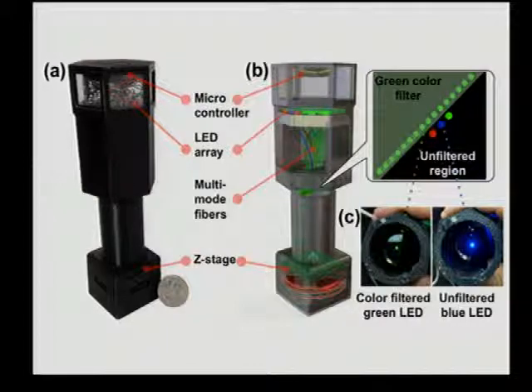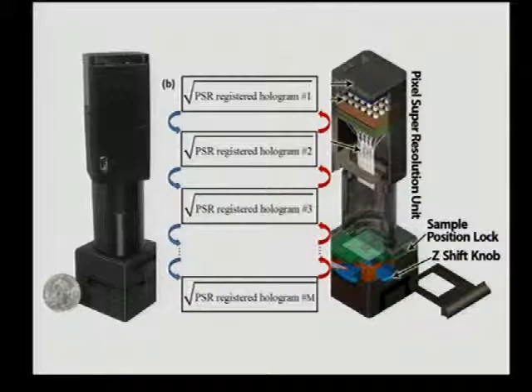But the advantage of Z-scan is, without any assumptions, you can have redundant information at different heights from the sensor surface so that I can take, for example, M measurements, typically M is 3 to 5, and throw a random phase to any plane and create a complex field that is very naive at first.